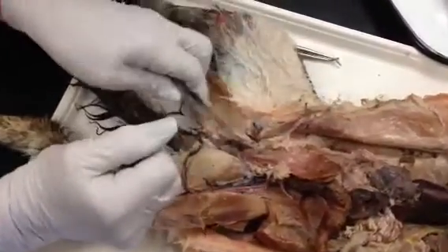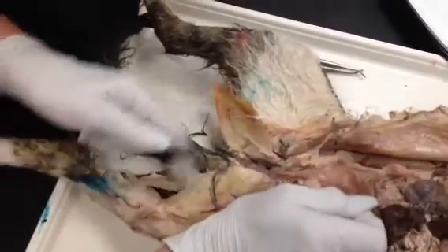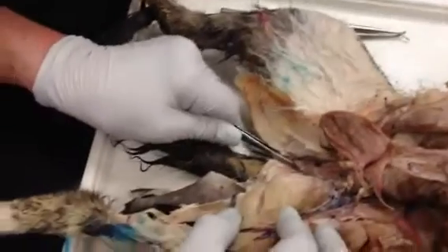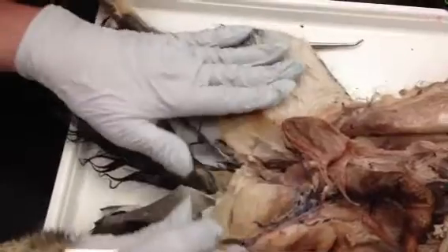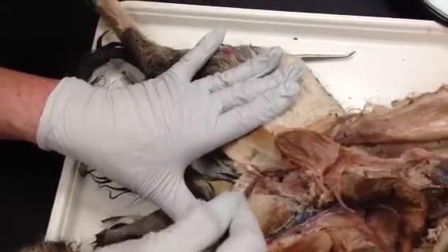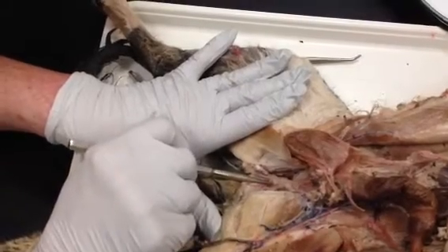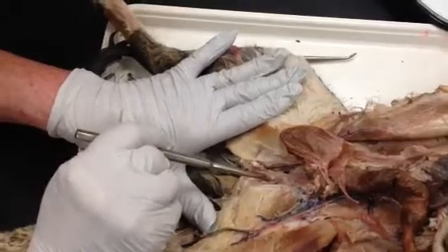past and behind the urethra, because here is the bladder. This is the urethra. The opening to the cervix and the vagina is the posterior opening. So if I take the probe and go in posteriorly, see that hole right there? That's going to be the opening into the body of the uterus. That's where my probe is right now, about where the cervix would be.